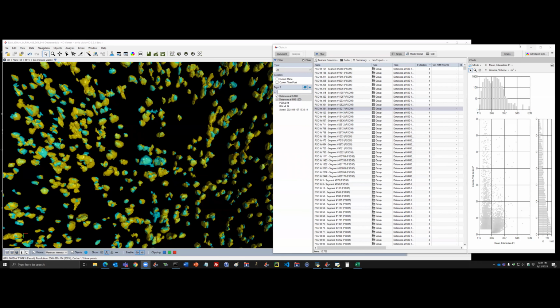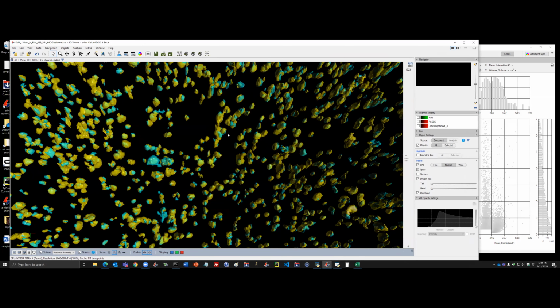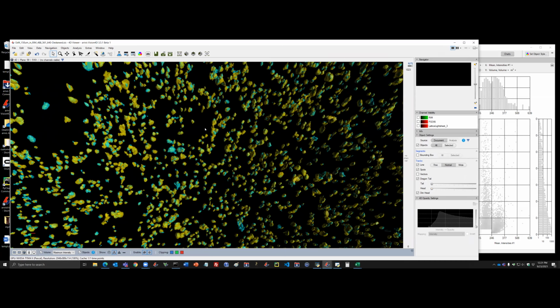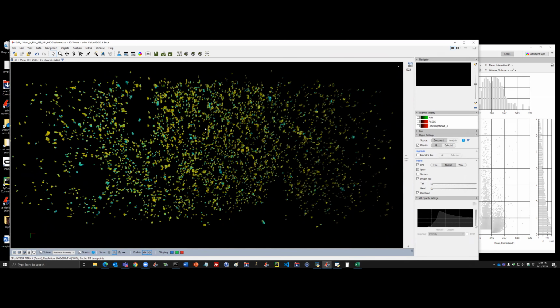Yeah, thank you, Matthias and Molly, for the introduction both to Arivis and to the biological problem we'll be looking at. So I'm sharing my screen, and let me know if you can see it. Yes, we can see it. Yeah, okay. So basically, we will talk about how to get from the raw intensity values to fully segmented particles for PSD95 and RIM.